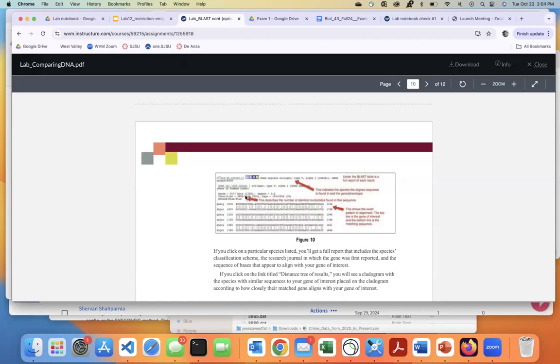It's also giving you some information on what percentage it matched with. And then it's giving you what sequence, so you can actually see where the alignment didn't happen. So we can see here it didn't happen. Here there was a misalignment. Here there's some spacing. So it's not going to match exactly, even if you're comparing two, right?